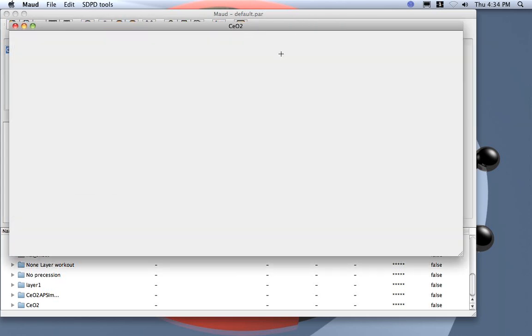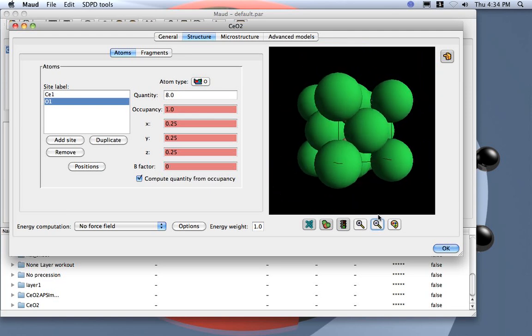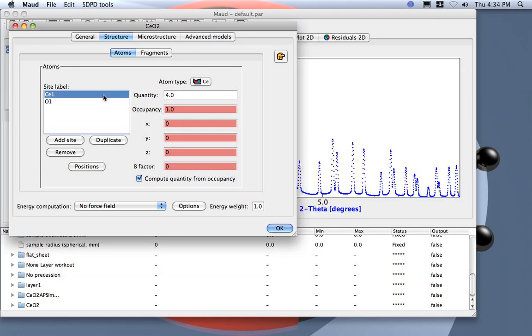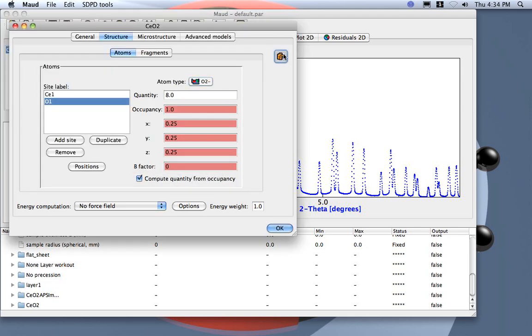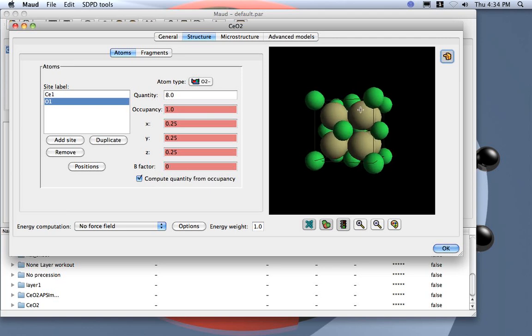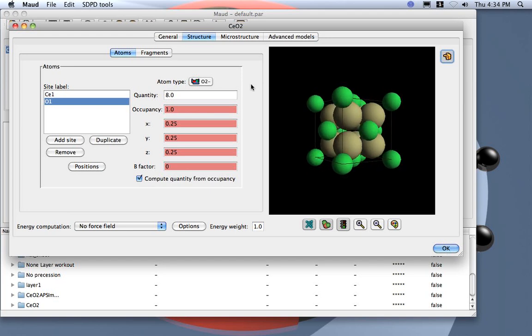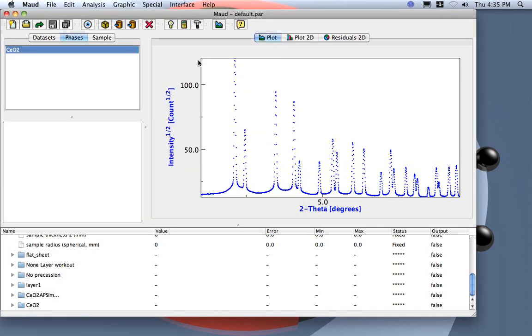We can check the structure in the crystal viewer — you can see the cerium and the oxygen. If we put the 4+ and 2- oxidation states, we get the correct smaller radius. The structure looks correct, so we don't need anything more.